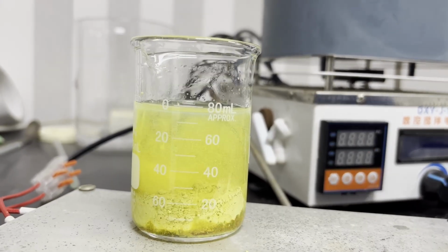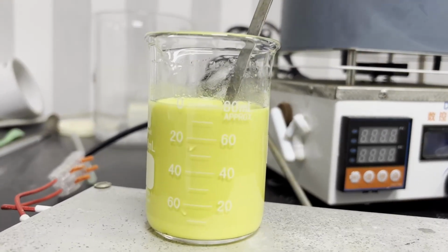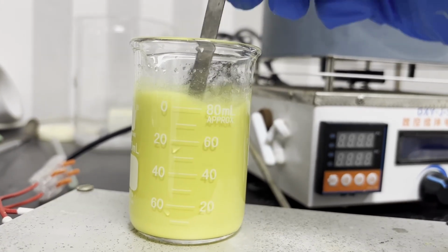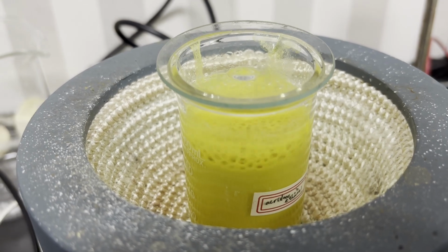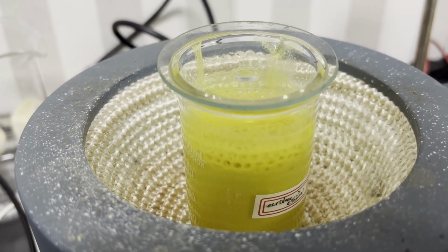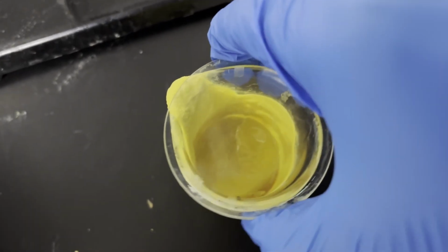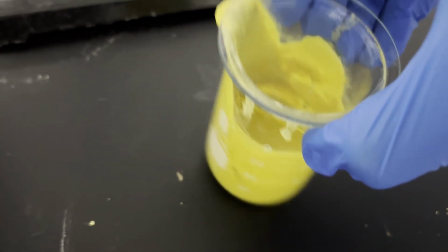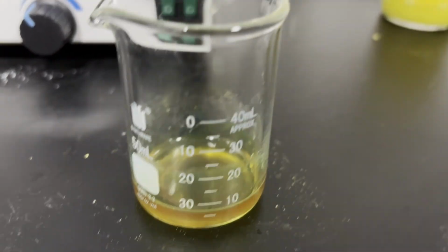Although you can see that the ethanol takes on a darker yellow color, which is probably the acridone anion, the majority of acridone still suspends in solution. I boiled the mixture for half an hour and tried adding more potassium hydroxide, but the solid still didn't dissolve. I decided to take a small sample of the resulting slurry and directly proceed to the next step. Surprisingly, I found that the yellow slurry dissolved very well in DMF, and the solution even emits a greenish fluorescence.